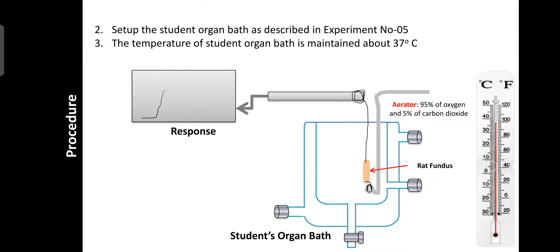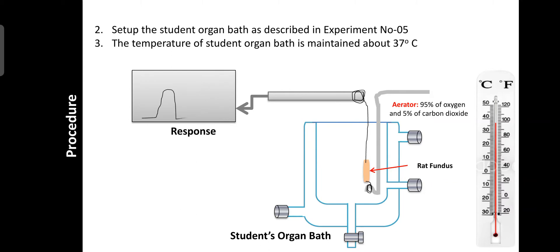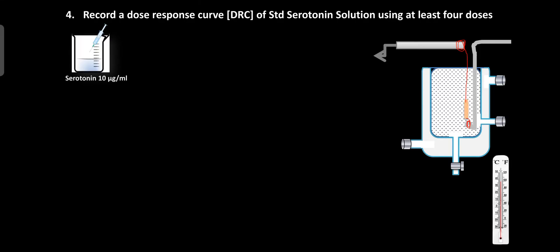The assembly is set up as described in experiment number 5 and the temperature of the organ bath is maintained at 37 degrees centigrade with the help of the heater and thermostat. After isolation, allow equilibration for about 30 to 45 minutes, then record the dose-response curve of standard serotonin solution using at least 4 doses. First, record the baseline without any drug for 30 seconds.